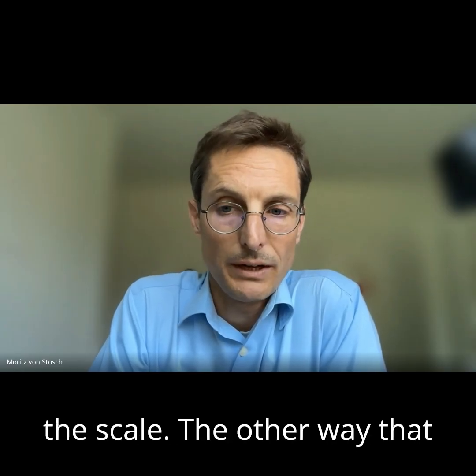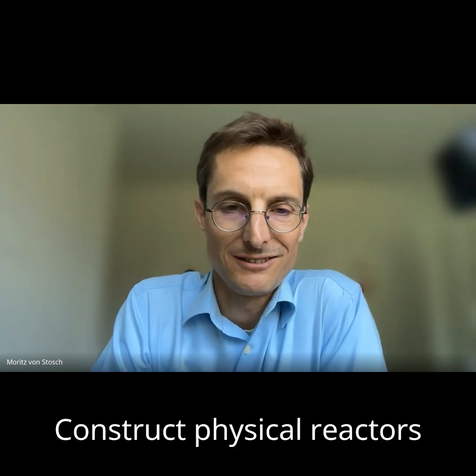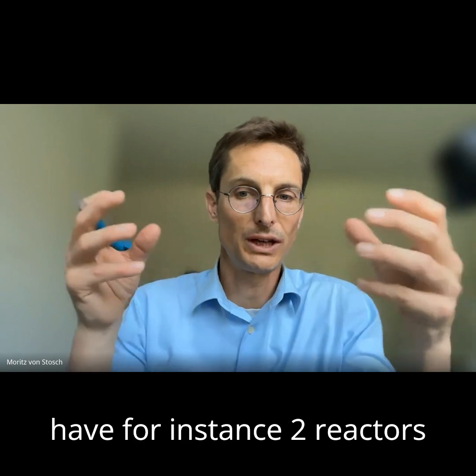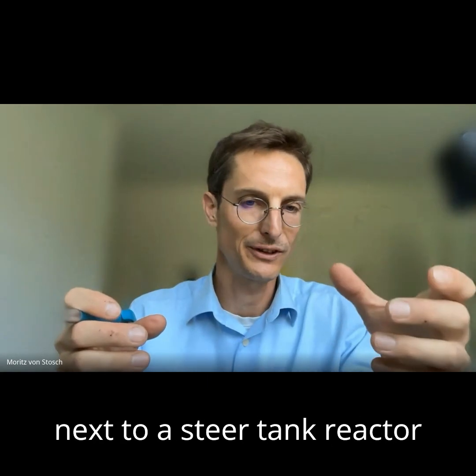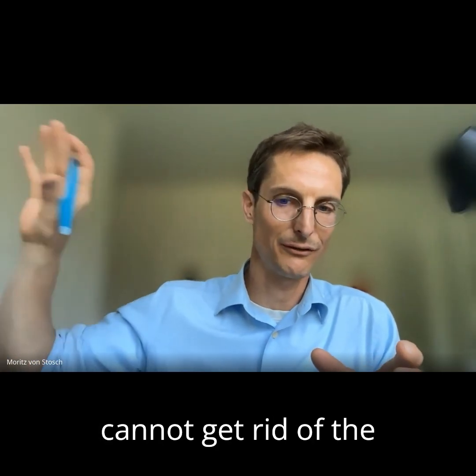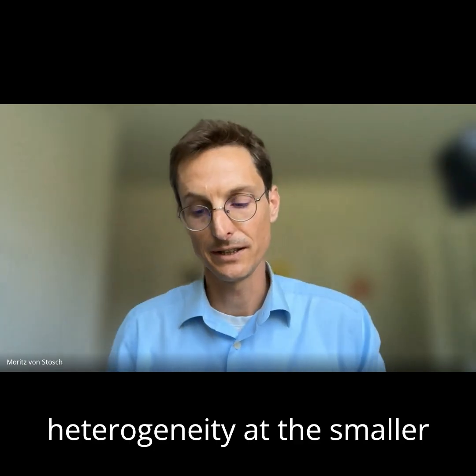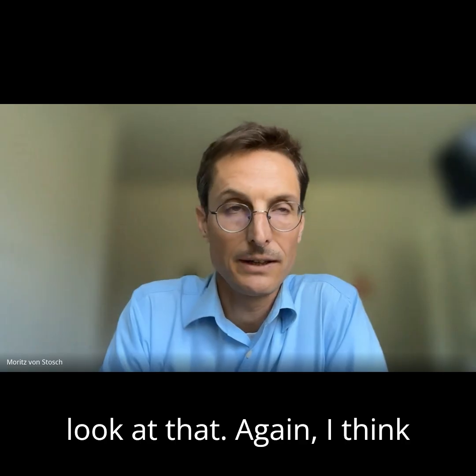The other way that one can use these simulations is to construct physical reactors on the small scale, where you have, for instance, two reactors sitting next to each other and flow is exchanged, or there's a plug flow reactor next to a stirred tank reactor, to emulate that there are these gradients at the larger scale. Therefore, if you cannot get rid of the heterogeneity at the larger scale, you can emulate the heterogeneity at the smaller scale. So this would be, for instance, one solution to look at that.